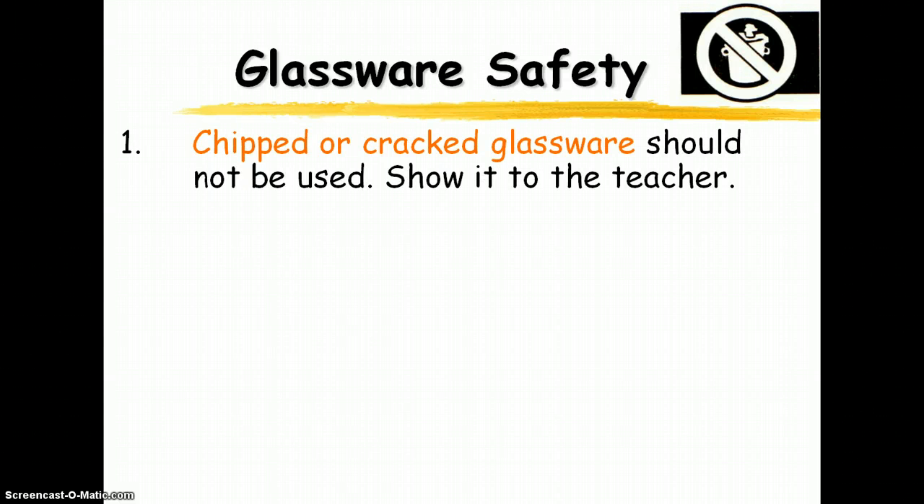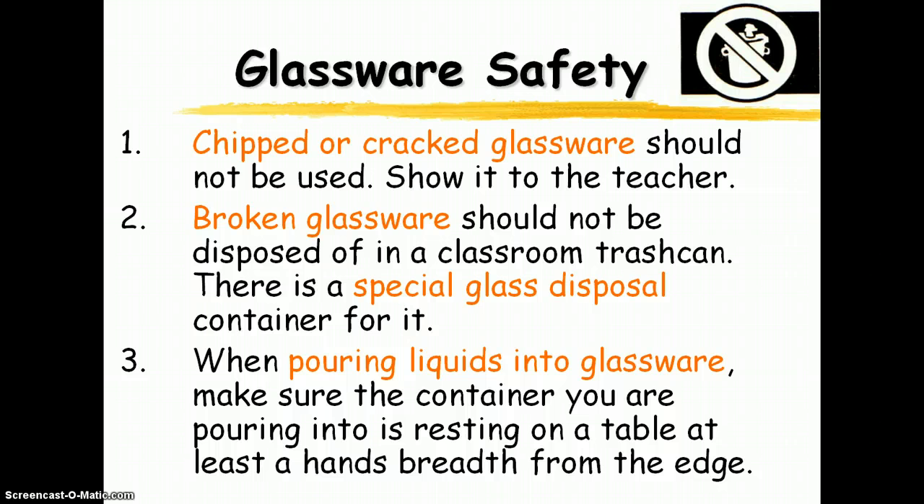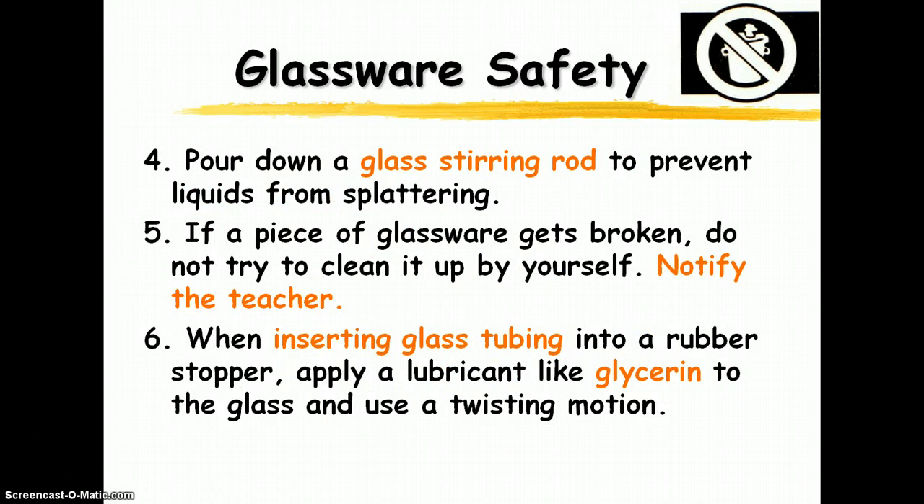Chipped or cracked glassware shouldn't be used — it's weakened. Just bring it to me and I will take care of it. Broken glassware should be disposed of in a special glass disposal container rather than the trash, where it would be hazardous for the janitors. Make sure your arm or hand is supported as you're pouring things — you don't want to free-pour in the lab. I'm going to demonstrate pouring liquid down a glass stirring rod to control the flow.